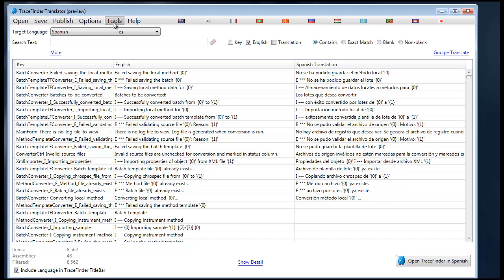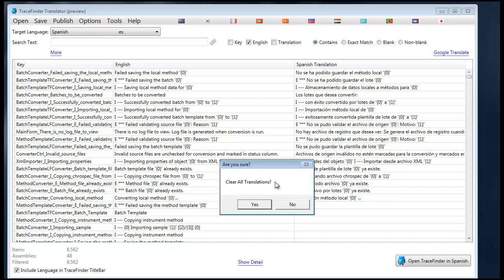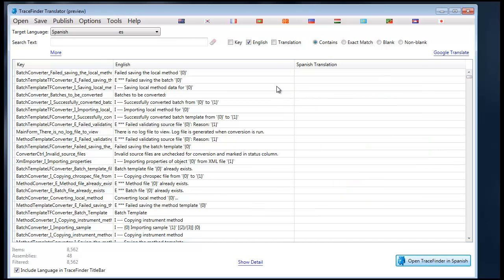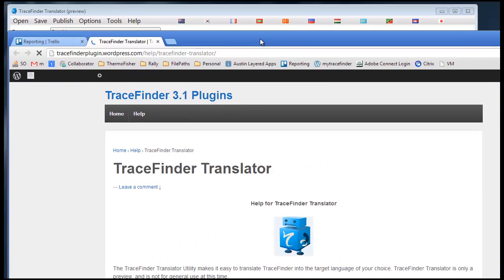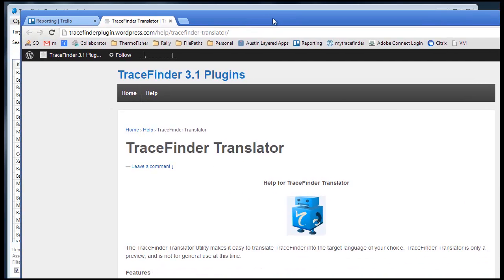The tools menu simply has the option to clear all translations. The help menu will take you to the online TraceFinder Translator help files.